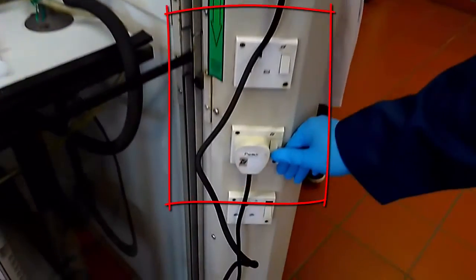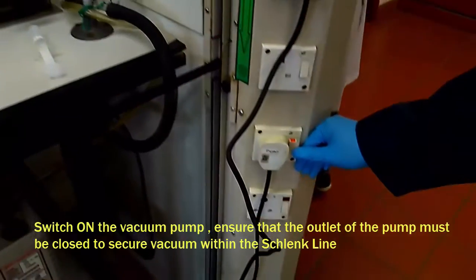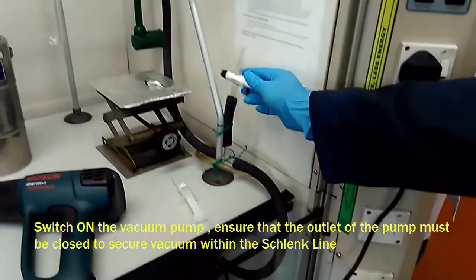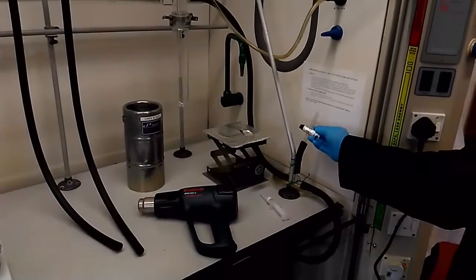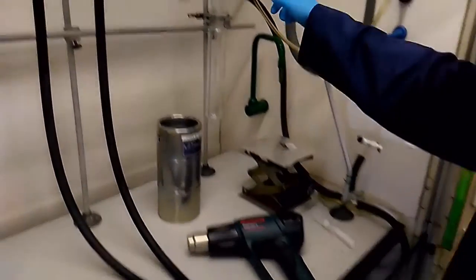So first of all, you're going to turn on the switch for the pump. And the outlet for the pump must be closed so that you can secure vacuum inside the Schlenk line. You see now the pump is connected to the system here. You see it's under vacuum.